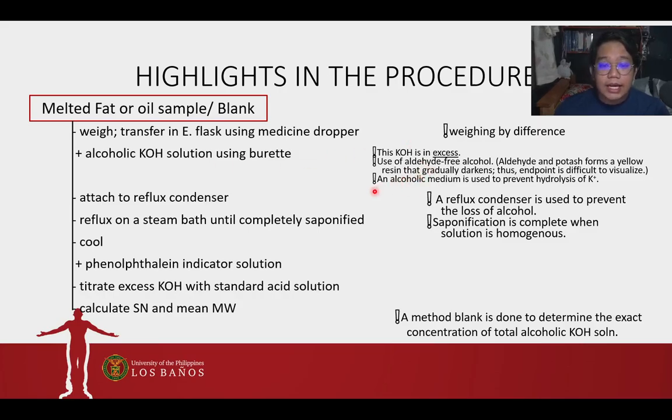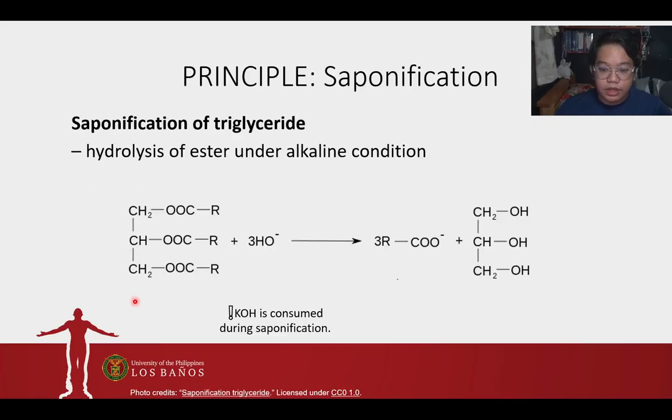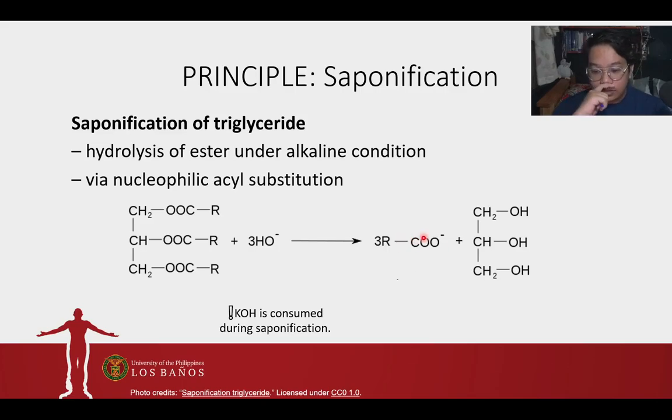So, bakit kaya kailangan alcoholic yung ating medium? It is used to prevent the hydrolysis of your potassium salt. Okay? As mentioned kanina, ito yun, di ba? Yung fatty acid natin will be on its salt form. So, meron kayong potassium salt dito.